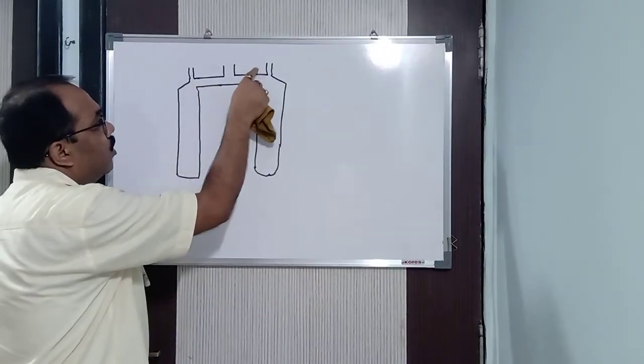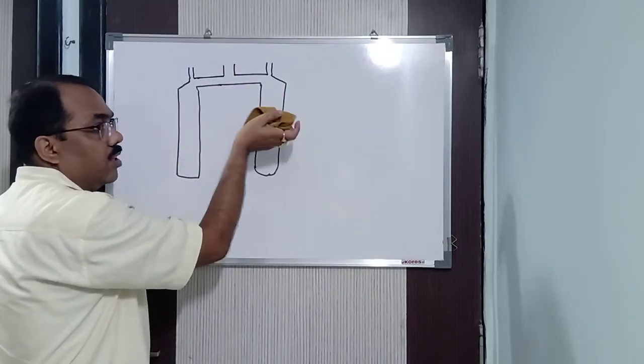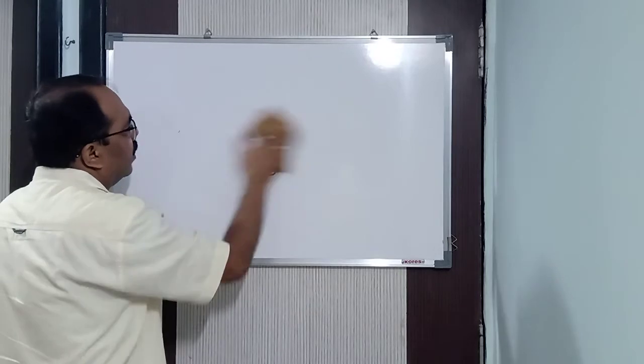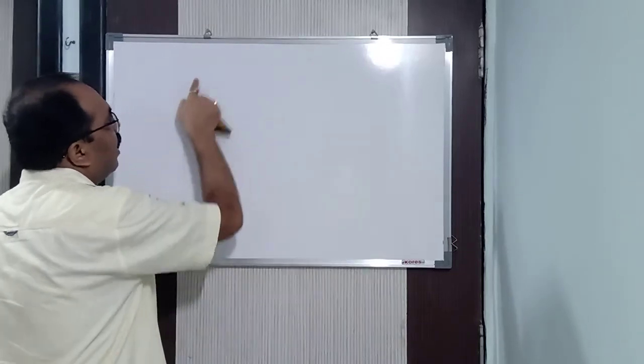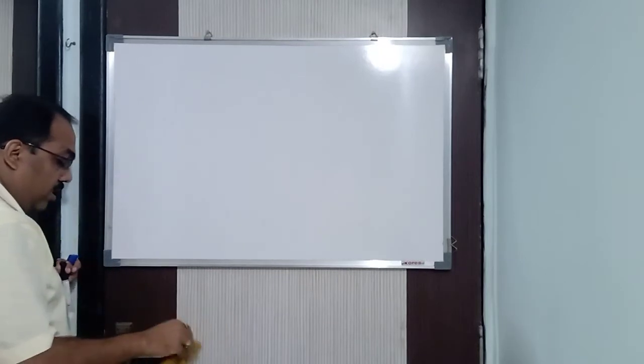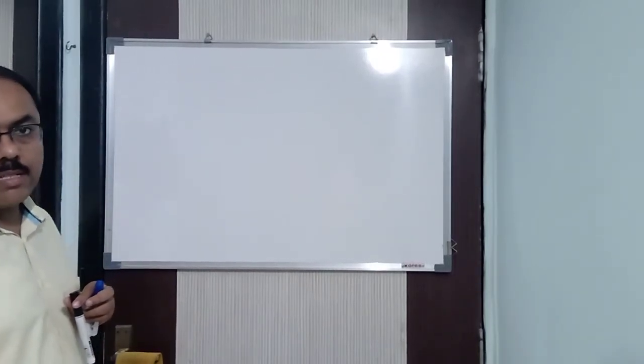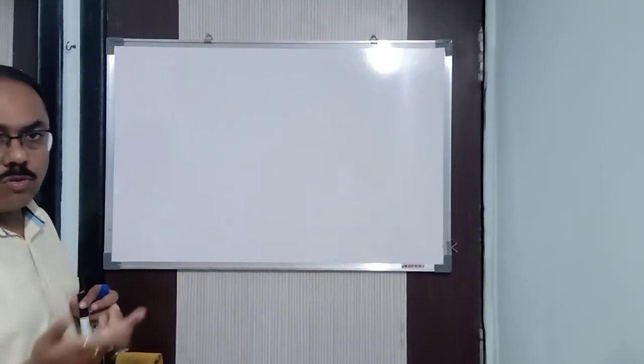We are having a stopcock here. The stopcock is there to open and close it. Here also we have the same thing. So this sort of apparatus we have here, and the electrodes are connected to a battery. Got it? When the current flows through it, then water dissociates into its ions and hydrogen and oxygen gas is collected at the respective electrodes.